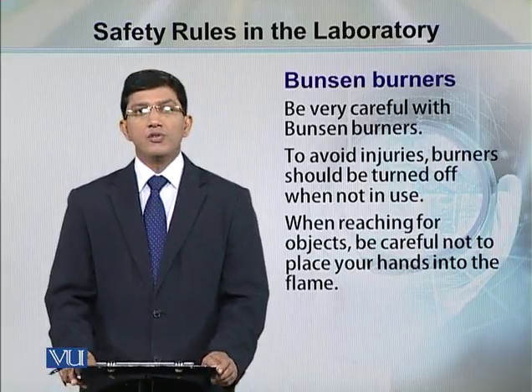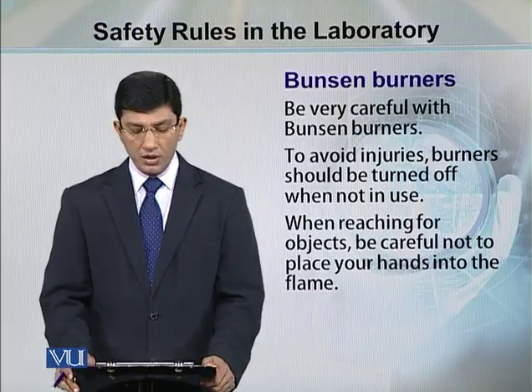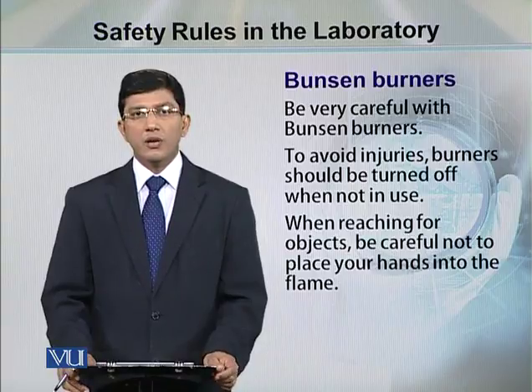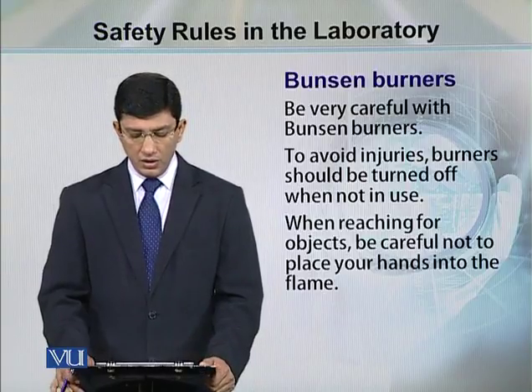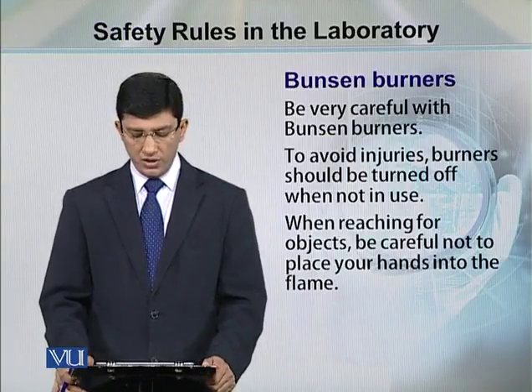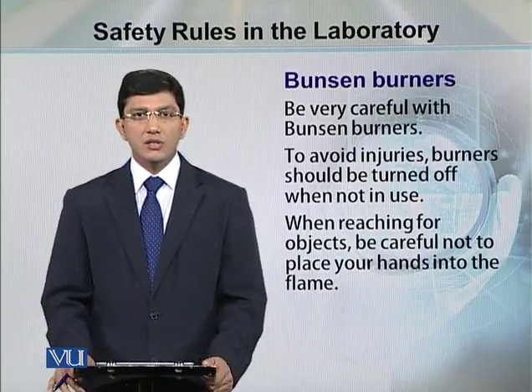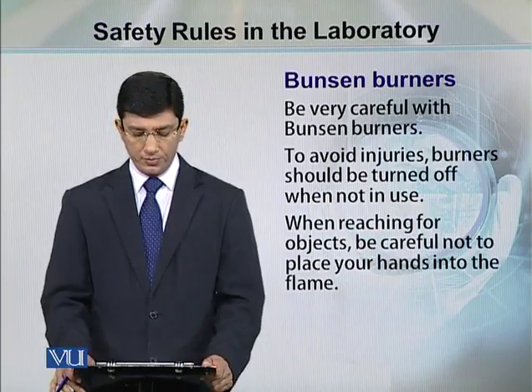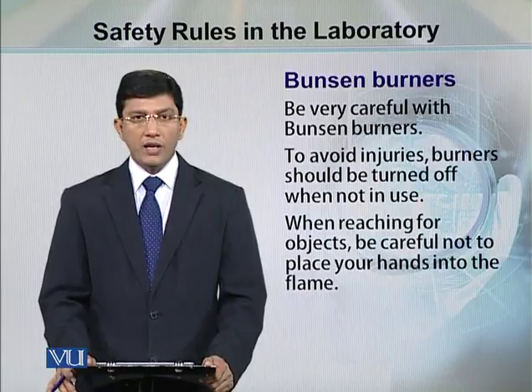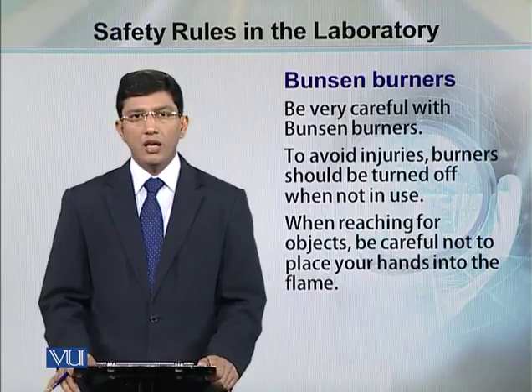In the lab, you also use Bunsen burners. These Bunsen burners are a source of flame, and you need to be careful while working with them. You need to protect yourself from injuries, and when these burners are not in use, just switch them off. Turn them off. While reaching for any object, be careful, don't put your hand in the flame.